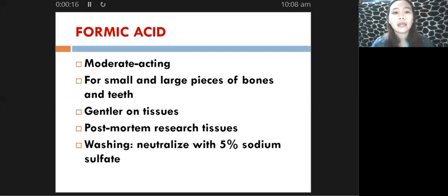In the last video, I already finished discussing the different factors that affect decalcification as well as the nitric acid formulations which are utilized for decalcification. For this video, I will be discussing the other acids which are utilized for decalcification.